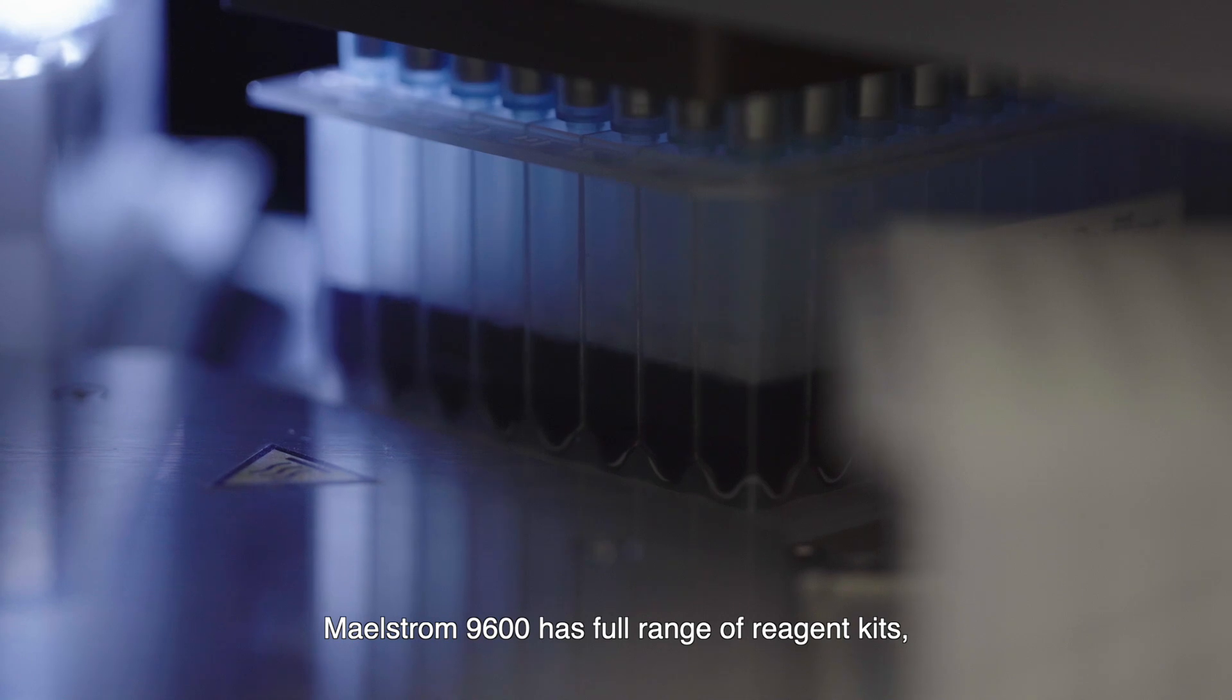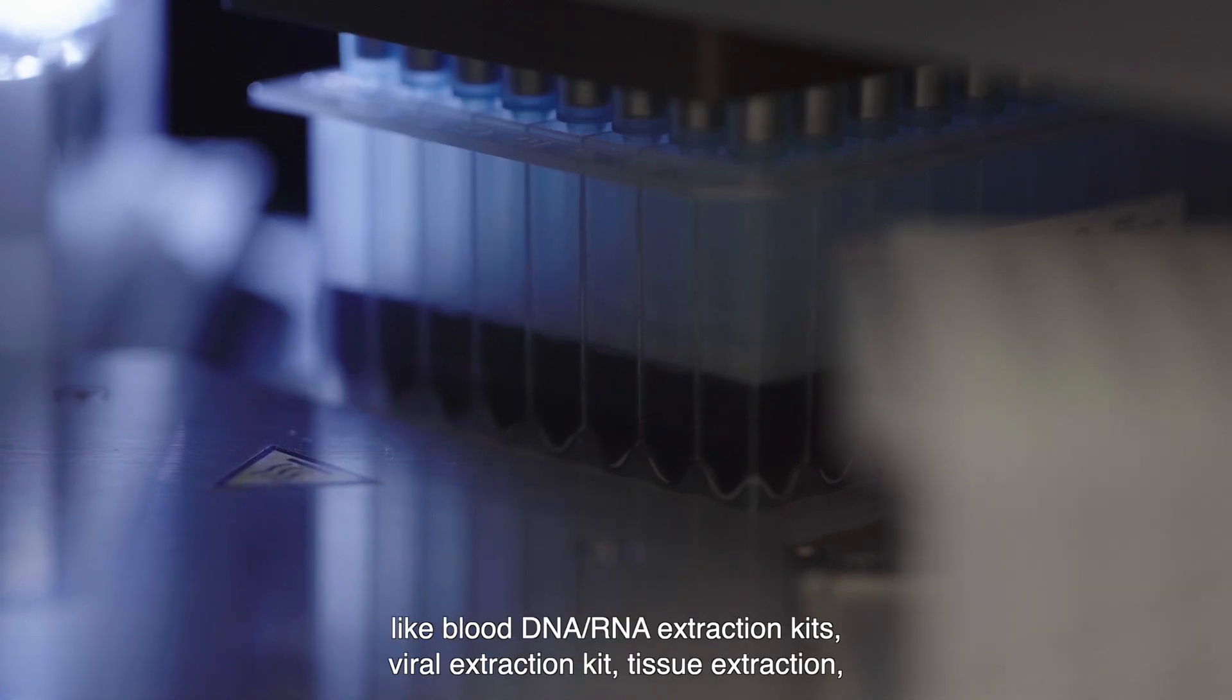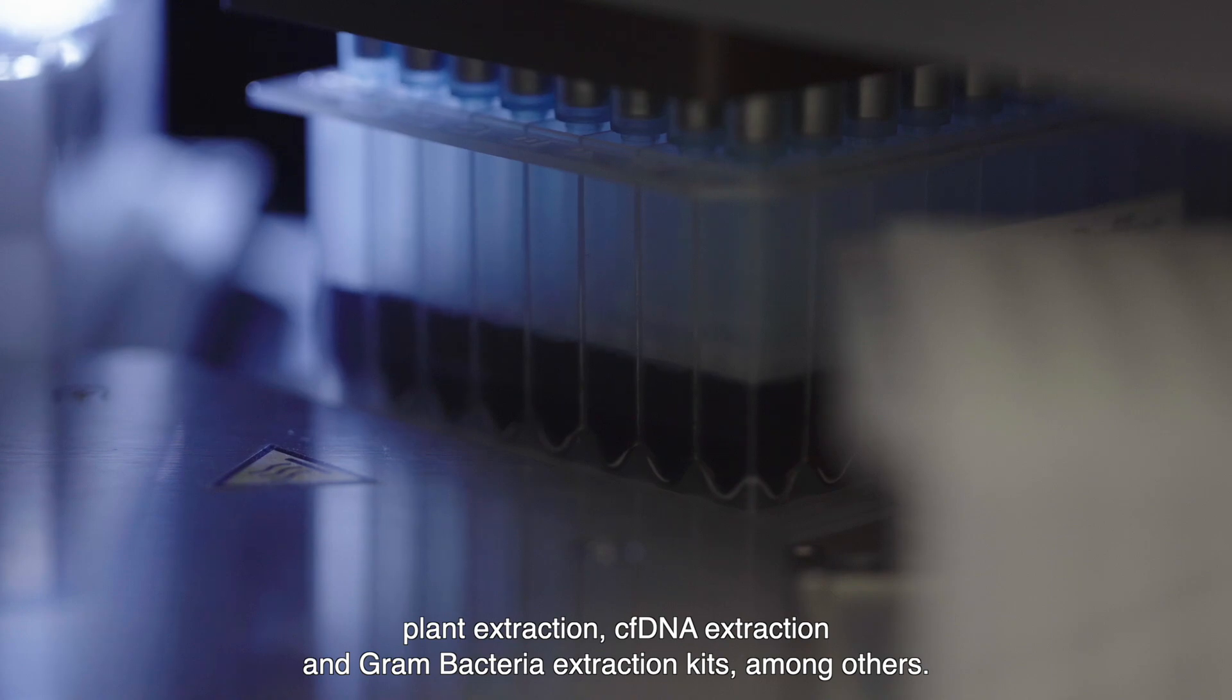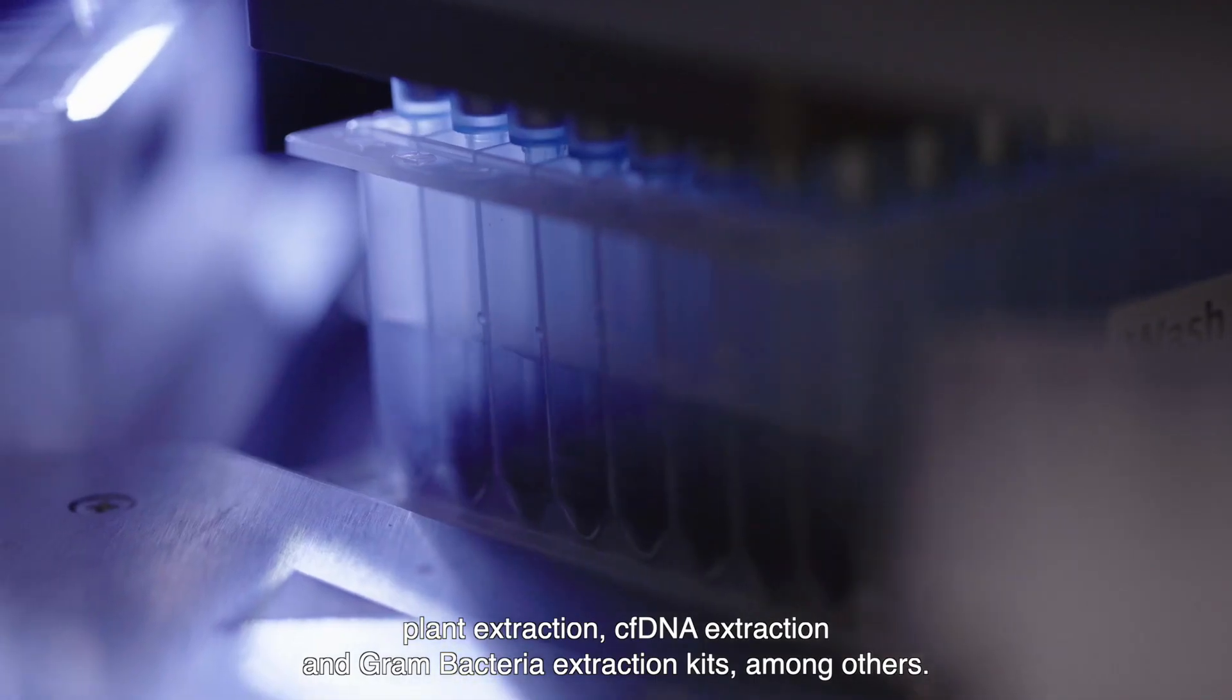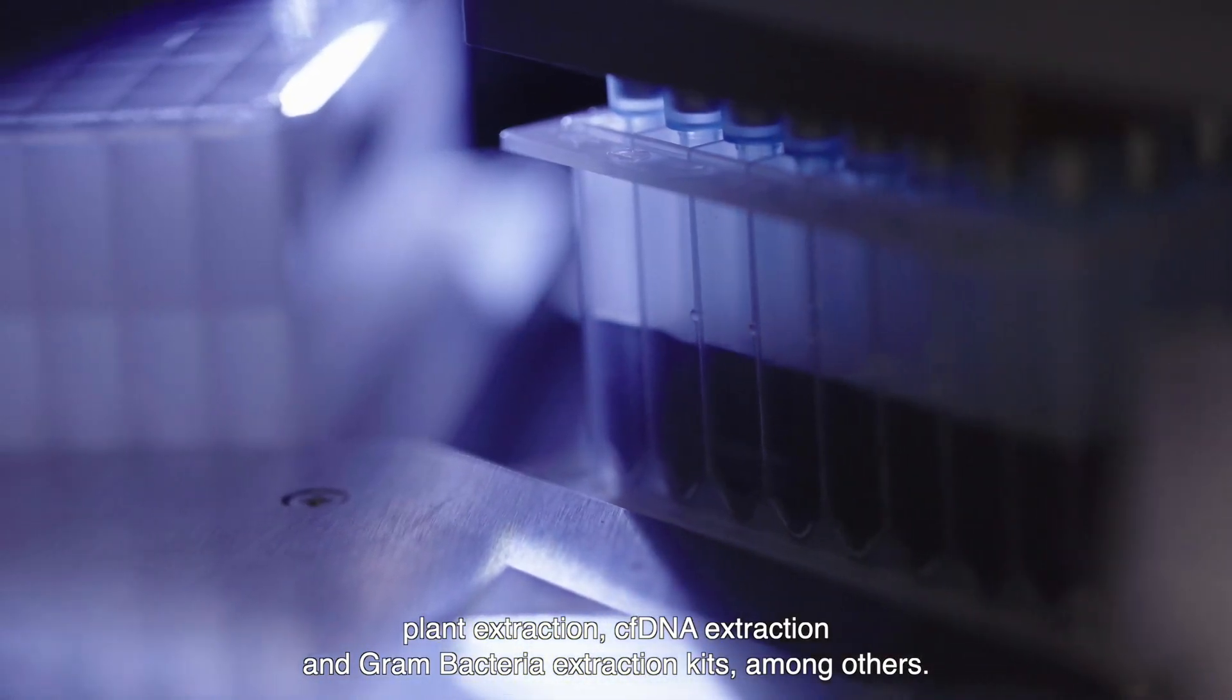Maelstrom 9600 has a full range of reagent kits like blood DNA and RNA extraction kits, viral extraction kit, tissue extraction, plant extraction, CFDNA extraction, and gram bacteria extraction kits, among others.